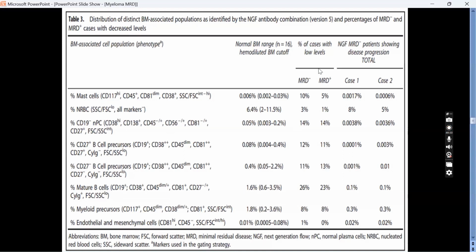I don't know how practical this is. My point is, whether you find marrow representative elements, it's fine, but to quantify them and check whether they are within that range, I don't see how practically possible that is. But anyhow, I just want to tell you that it has been established and this exists.